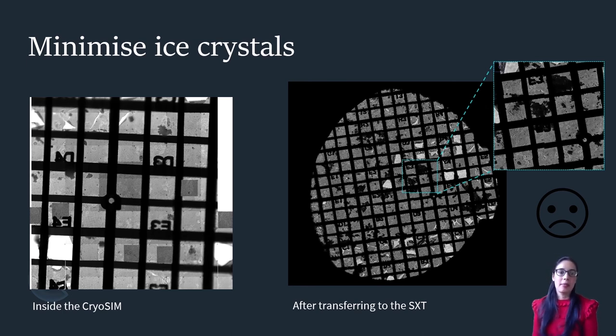In this case, this happened because we left the sample in the cryoSIM for too long. So there were ice crystals which formed from the moisture in the air. But this can also happen if the liquid nitrogen that's used isn't filtered properly or if it's left too long after filtering.